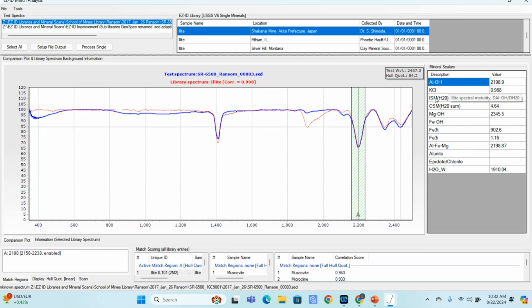So you have to imagine, as illite converts into that true mica, this is going to track the illite dehydration process, which is why, if you see here, it actually shows the mathematical equation. So D means depth. That's going to take the depth of the ALOH feature and divide it by the depth of the water feature. So when we talk about illite dehydration, that's what it's mapping.